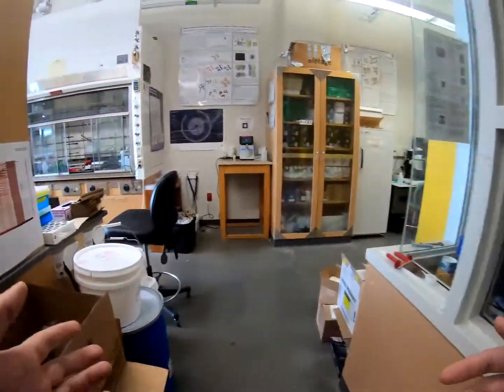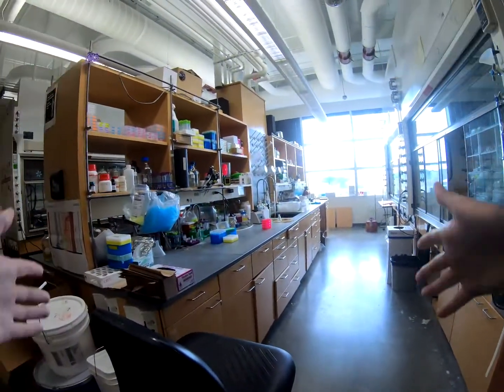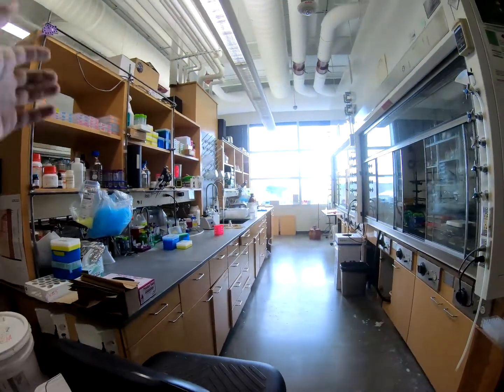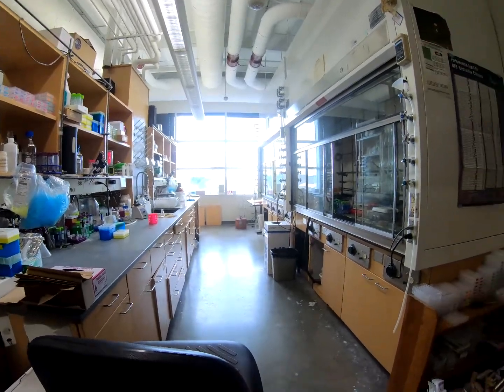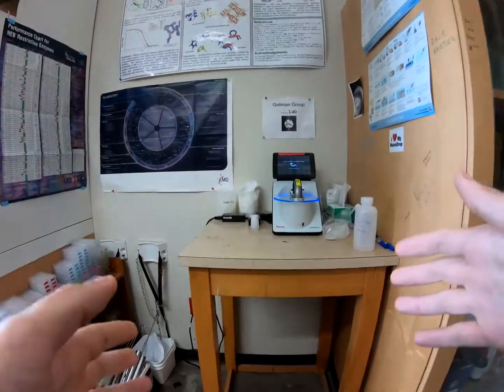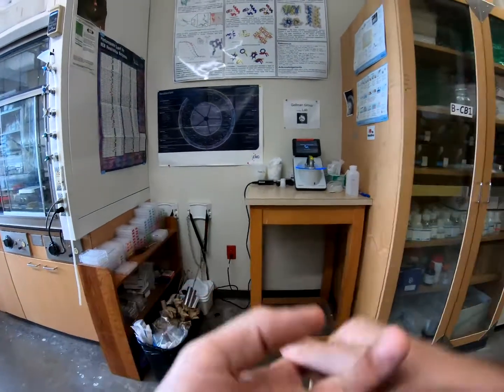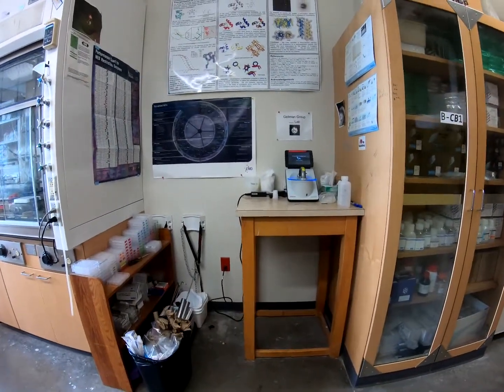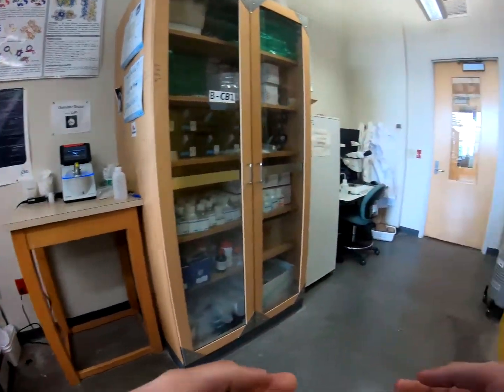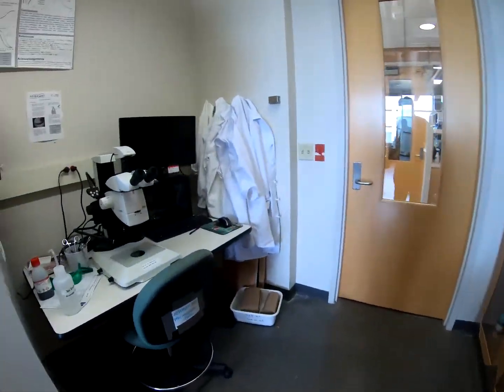Now, coming over to the last part and the right side of the room, we've got more lab benches and fume hoods down this alley. A little to the right here, we have our NanoDrop, which we use to assess concentration of peptides and compounds we're working on by absorbance. And then further down here into the last corner, we've got our microscope.